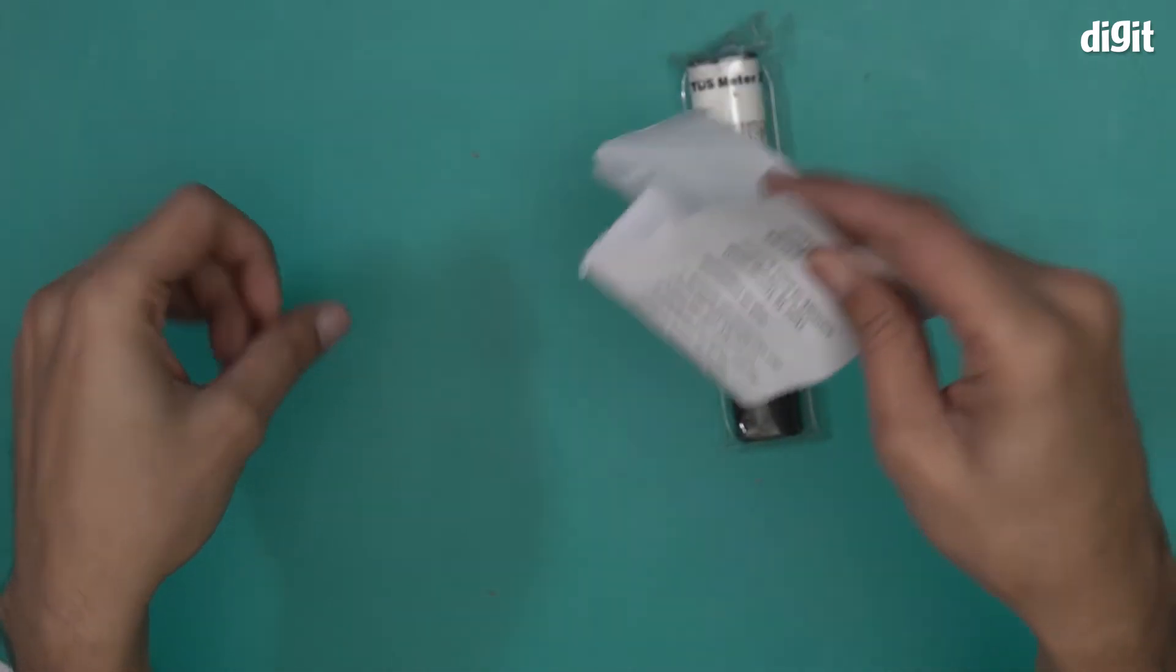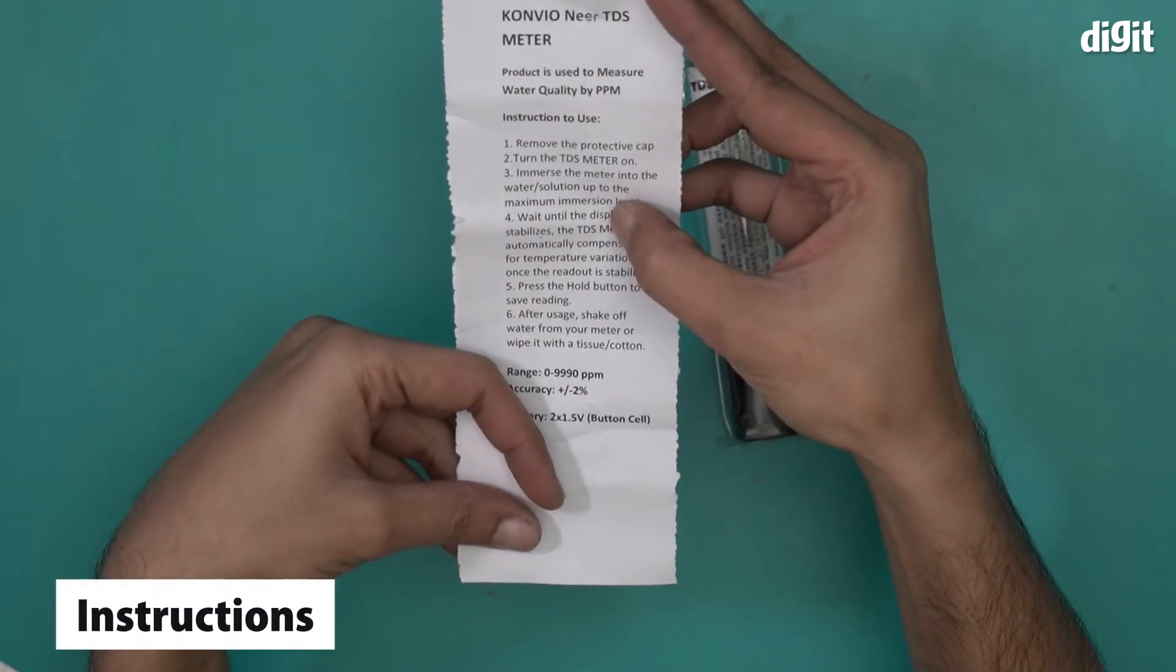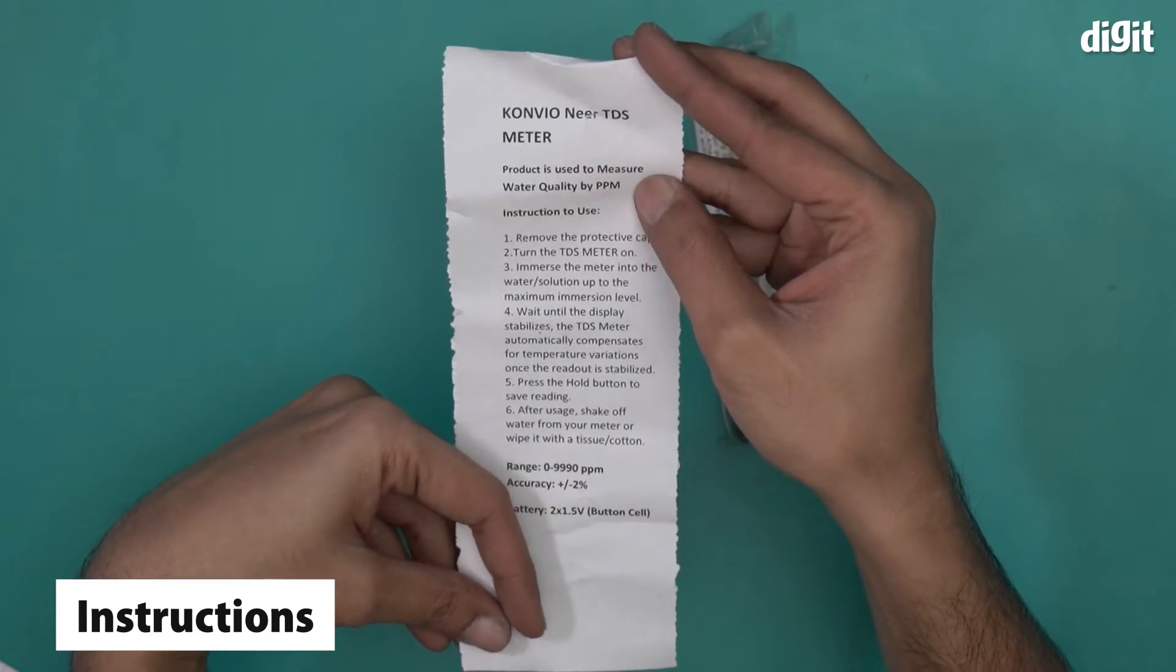So there you go. These are the components of the box. We have basically instructions on how to use this particular device. Product is used to measure water quality by ppm.